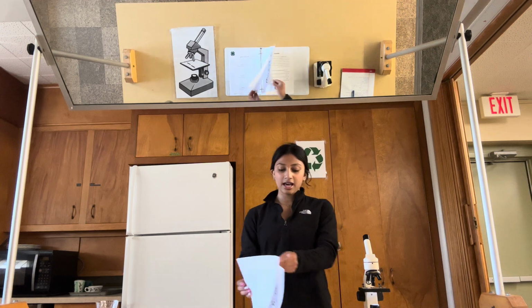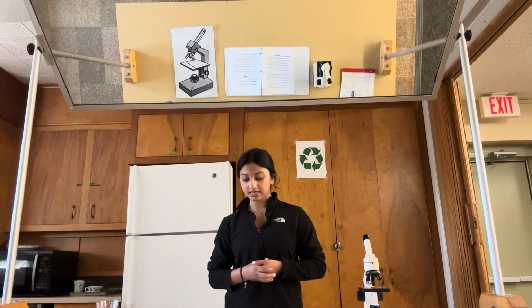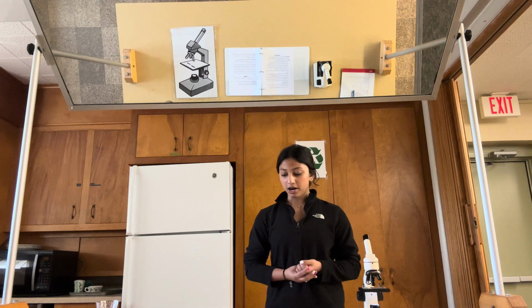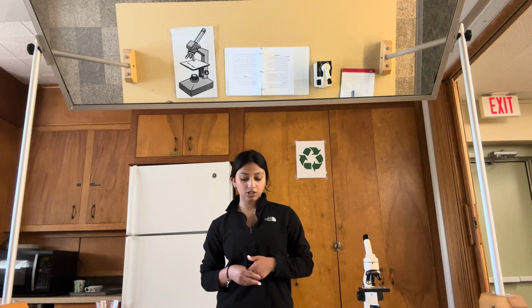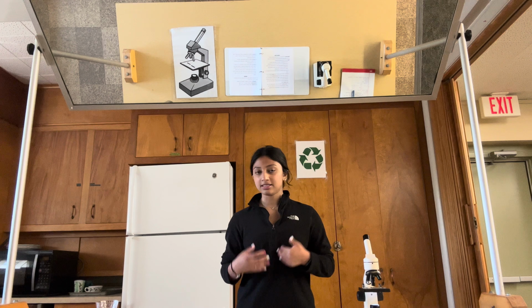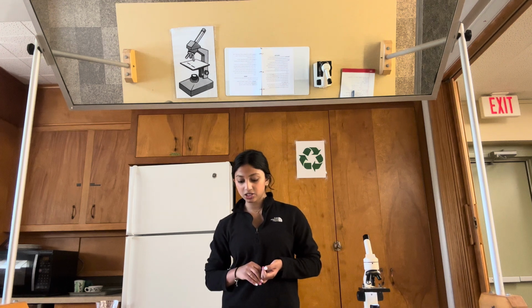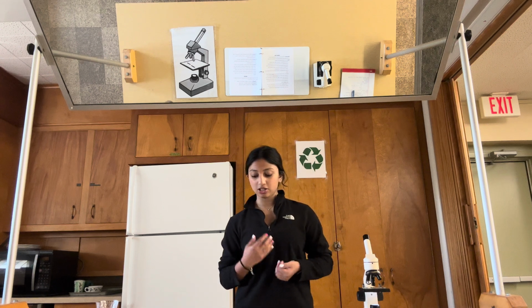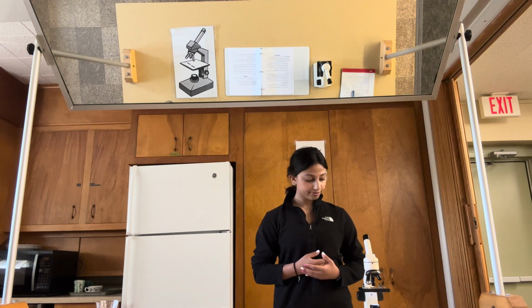And then at the end, we're just going to debrief with the students, asking them what 3 different parts of the microscope are, what are some uses of it, and the 3 essential tasks that a microscope allows us as scientists to accomplish. It allows us to magnify an image, resolve an image by separating details, and contrast by rendering details that are visible to the eye.